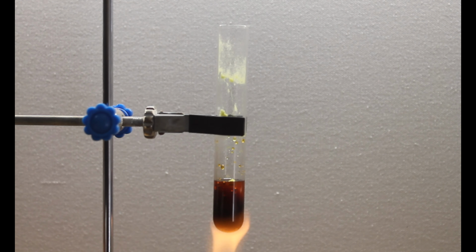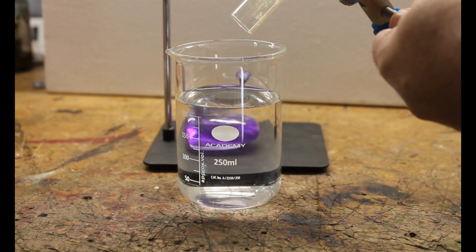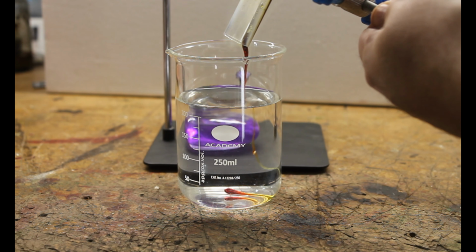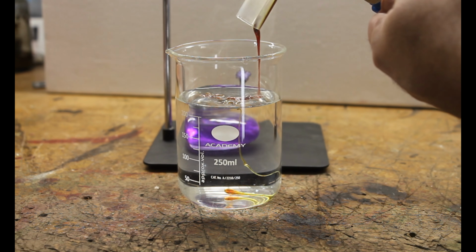Our sulphur is now more or less all melted, so it's time to take this off the heat and pour it into some cold water. This melted sulphur is very viscous and pours very, very slowly. But as it contacts the cold water, it instantly hardens into our sulphur polymer.